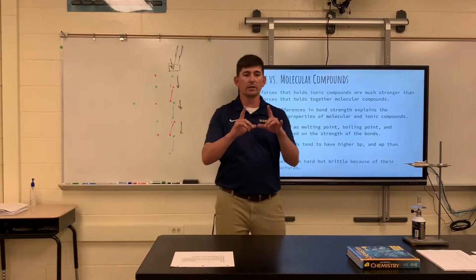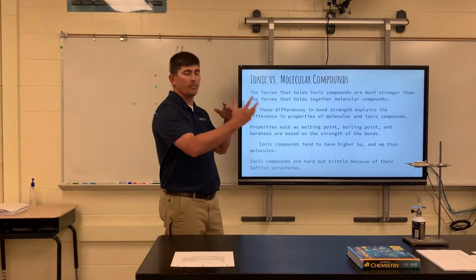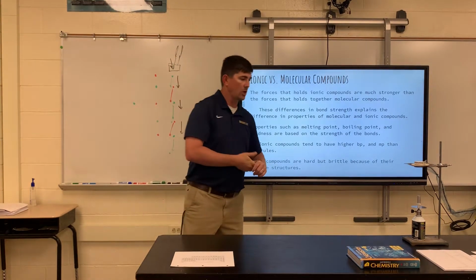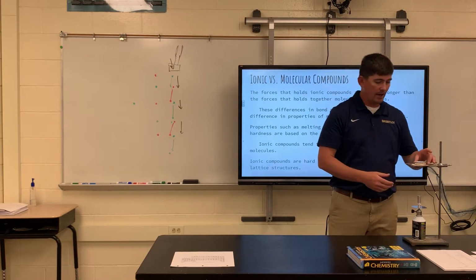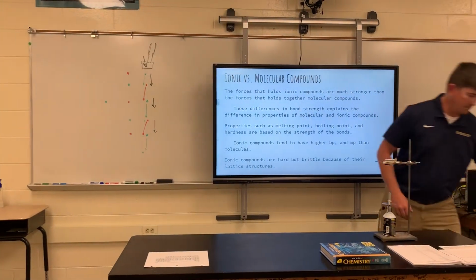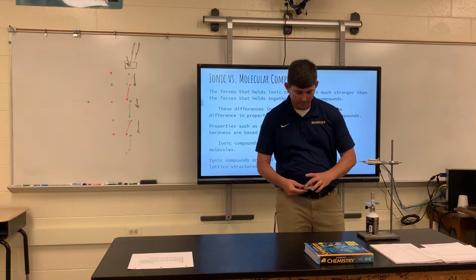All right, so I'll do a quick little demo with you guys, separate from the video, on comparing the ionic and the molecular compounds. So I'll show you what I got going on here. I just have a heat source, and I have two little containers here. One of them has salt in it, one of them has sugar.